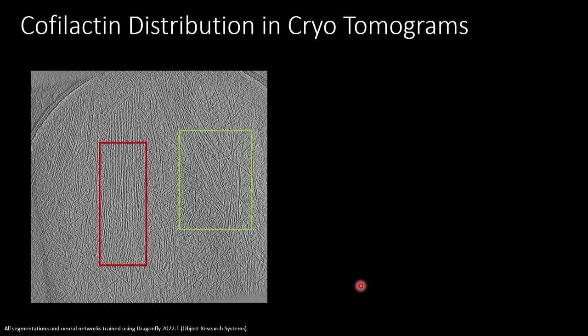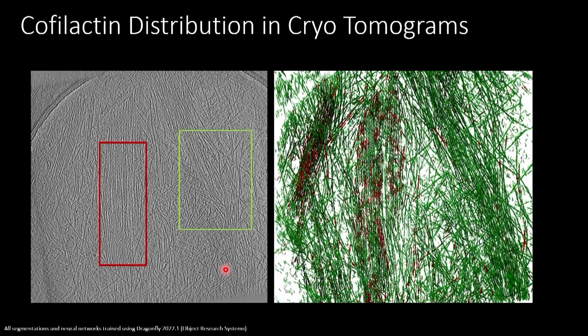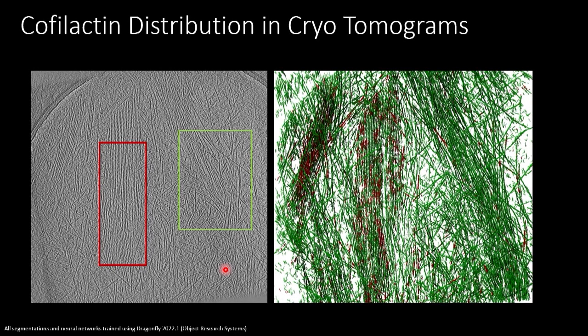Unfortunately, deep learning didn't work out well at first. Because of the nature of cryo-electron tomography, the data is very noisy with no real way to improve the signal, and we have imaging artifacts from the missing wedge — significant anisotropy in Z. Even segmenting just two boxes by hand to differentiate cofilactin from regular actin didn't give me a good training set, and deep learning segmentation to differentiate these filaments didn't have great success.